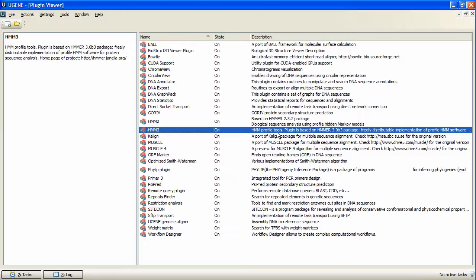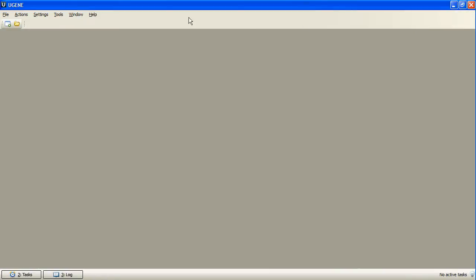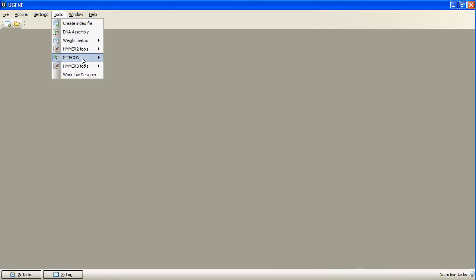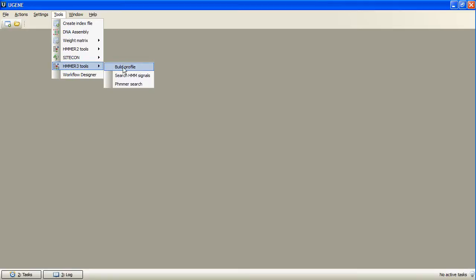The tools are available from Tools, HMMER 3 Tools menu. To search for homologues of a family represented by a multiple sequence alignment, we need to build a profile hidden Markov model, or profile HMM, for the alignment.